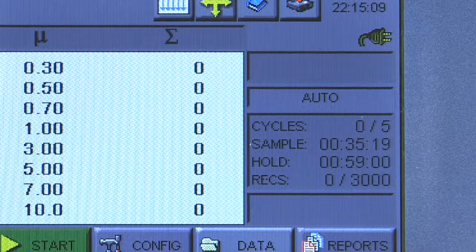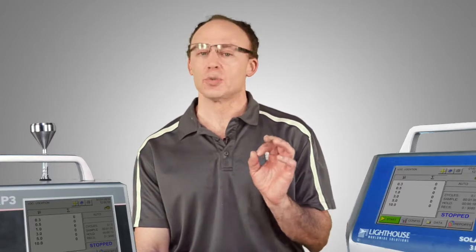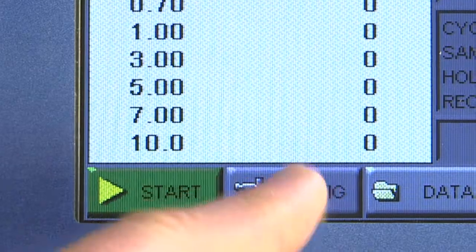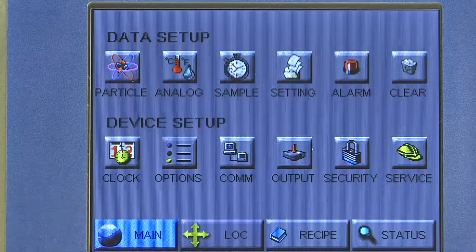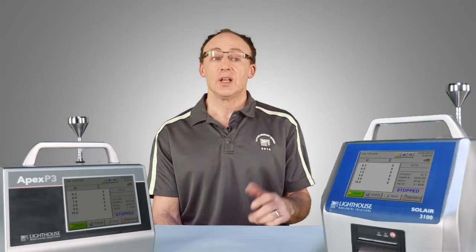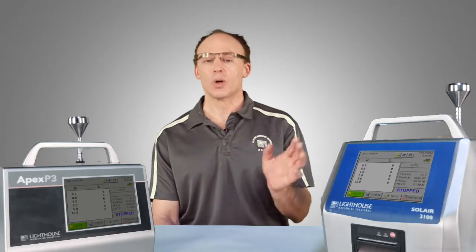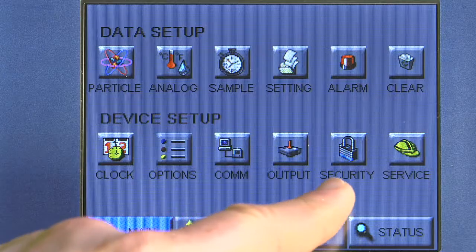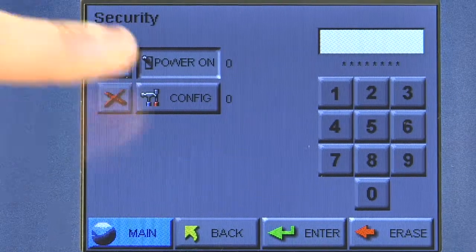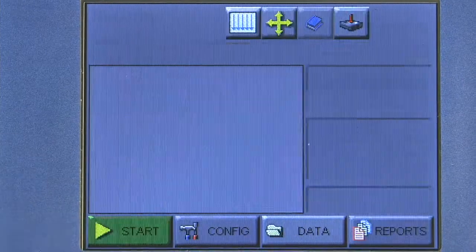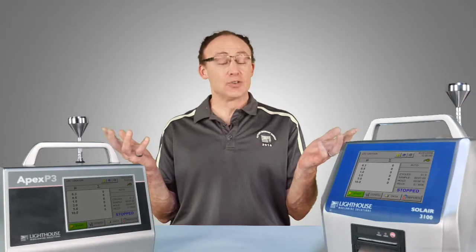Because I have both passwords enabled, if I want to reconfigure the instrument I hit the configuration button and have to enter zero zero zero zero, then Enter — now I'm in my configuration screen. If I want to delete or erase my passwords, I can go to the security button and simply disable both of them, hit Enter, and we're back in business.